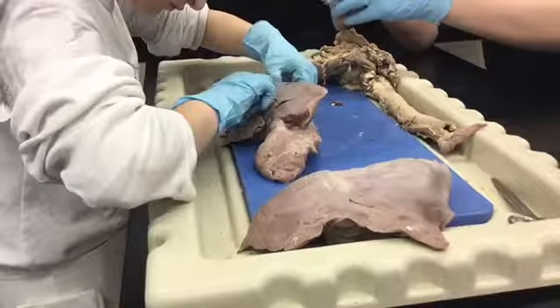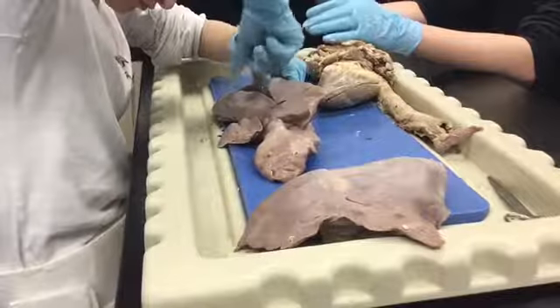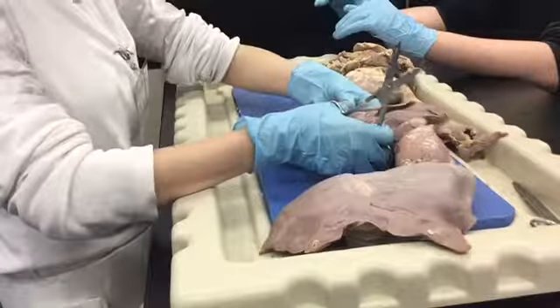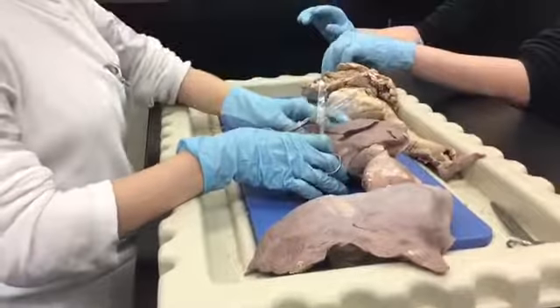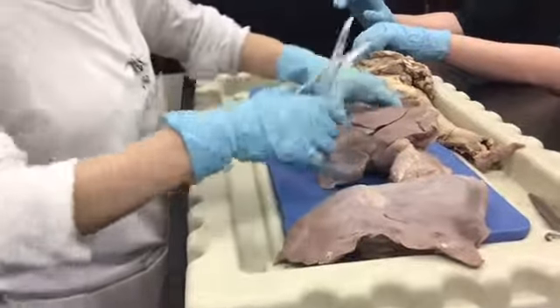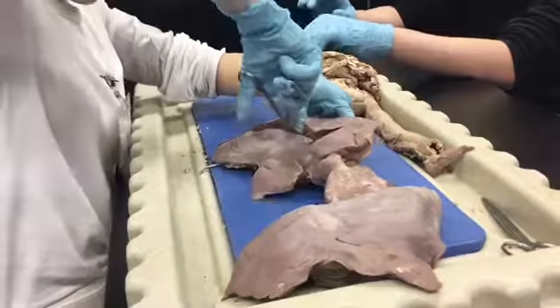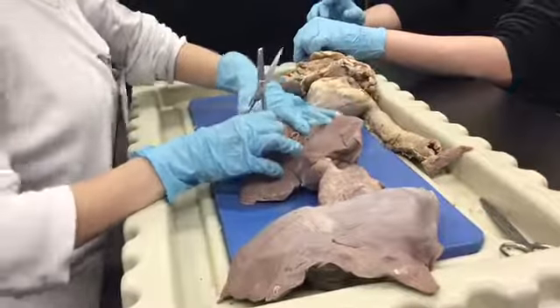The key is that the myocardium on the left side is much, much thicker because it's got to pump blood everywhere, whereas the right ventricle only has to pump to the lungs, which are right there. So it doesn't need to be as strong. That's the key. For your quiz tomorrow, I'm not going to ask you about the superior and inferior vena cava. Those are kind of hard to see. Everything else is fair game. Do you want a quick review of any of those, or do you feel pretty good about these?